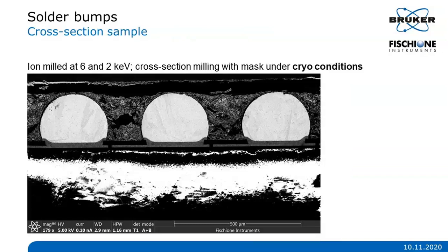If you detect a row that has a defect, you want to investigate it, you cut the sample before the solder bumps. The solder bump is never affected mechanically. Then you align your mask in the center on the solder bump and just remove what is above. So you get a beautiful cross-section in the center of the solder bump for failure analysis.